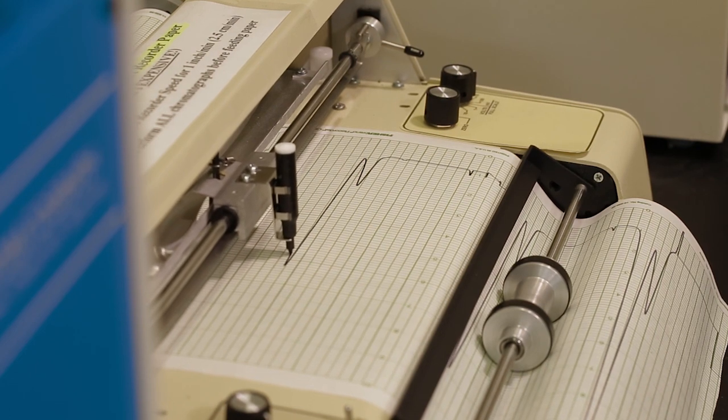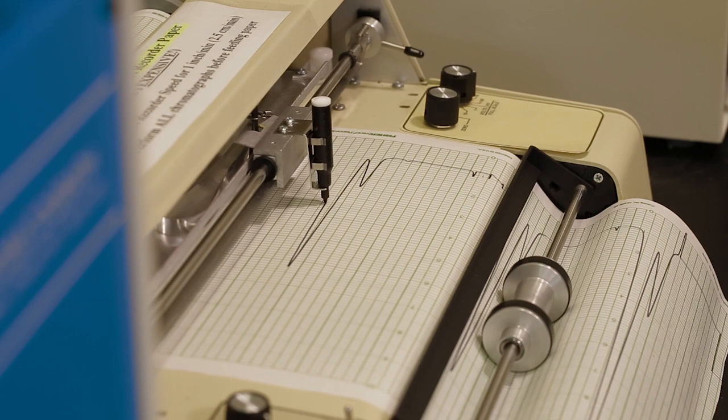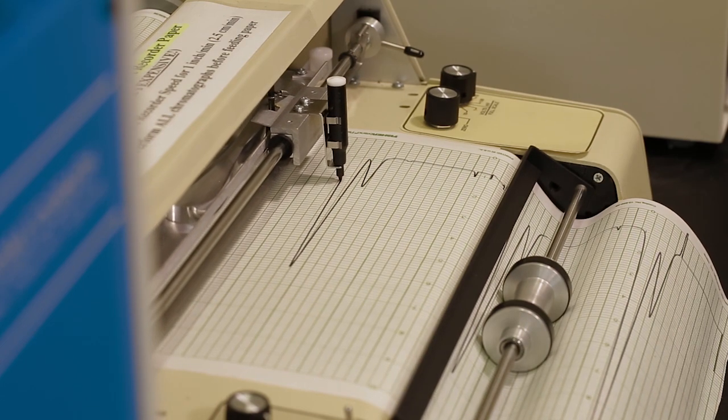While the sample is running, a basic strip chart recorder prints the gas chromatogram. The areas of the peaks are calculated manually.